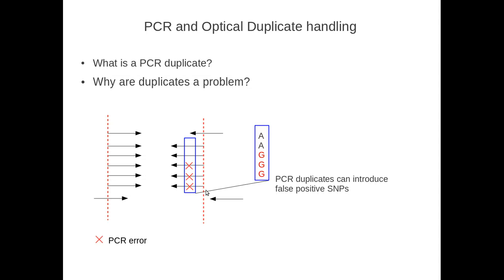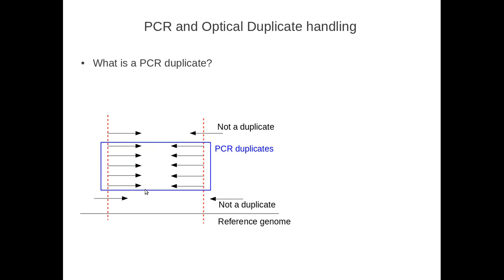Once again, we will occasionally be tossing out reads that are actually perfectly legitimate because they come from two independent original fragments that may not have been amplified successfully at all during the PCR step, in which case this situation wouldn't be a problem. But in the event that these are amplified products that represent a single template DNA in the original genomic DNA preparation, then this is a problem. So I'll let you think about that. Feel free to ask questions if that doesn't make sense.